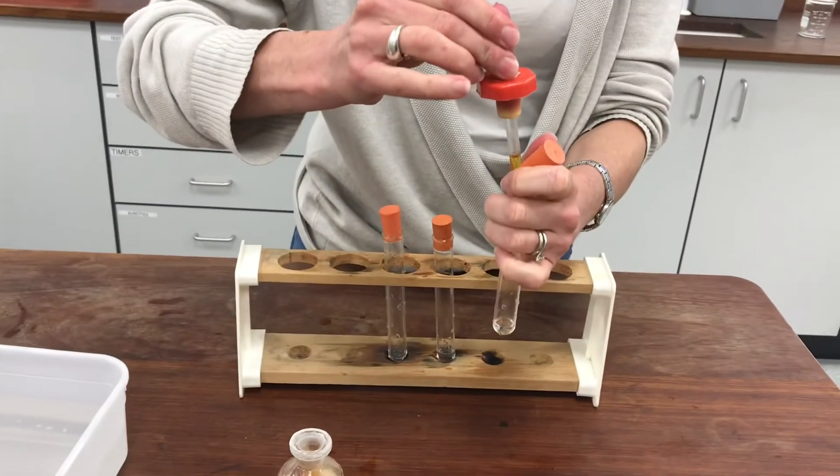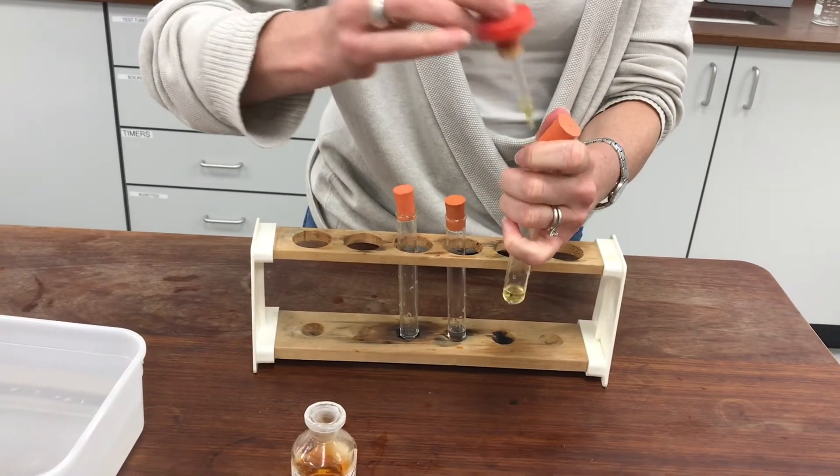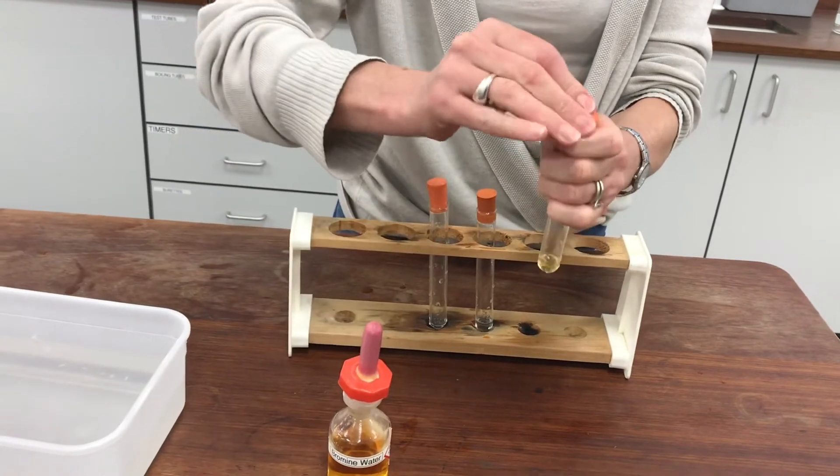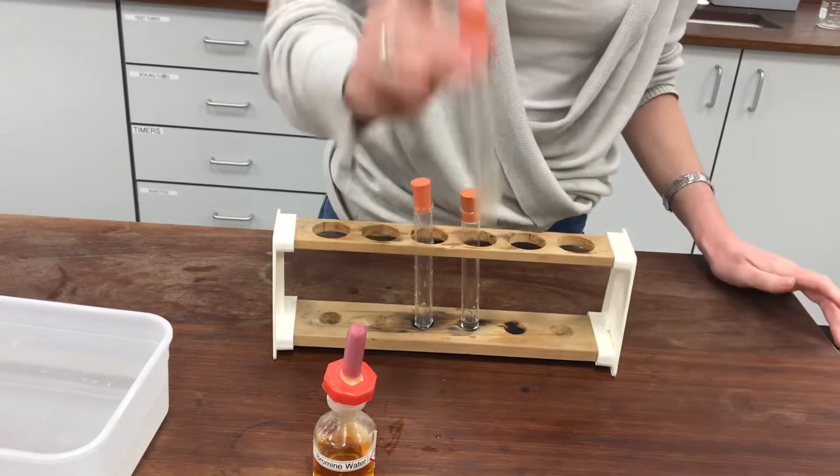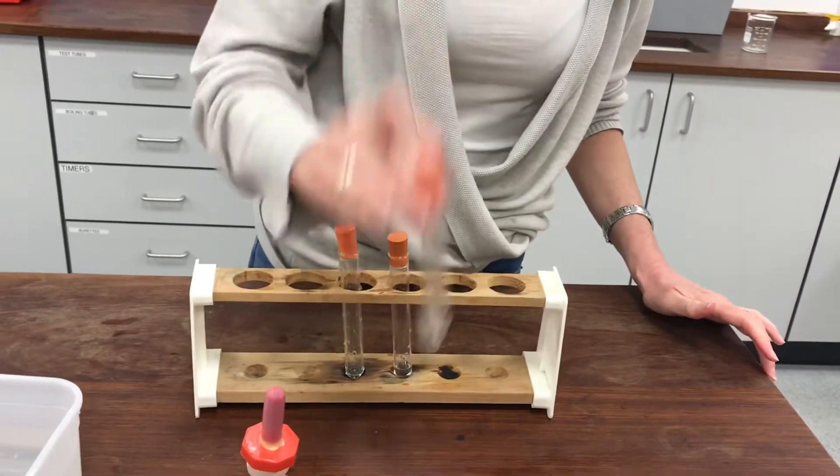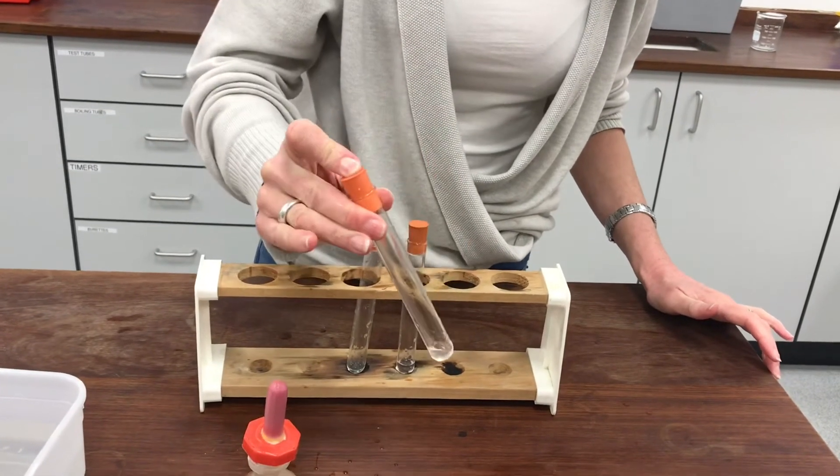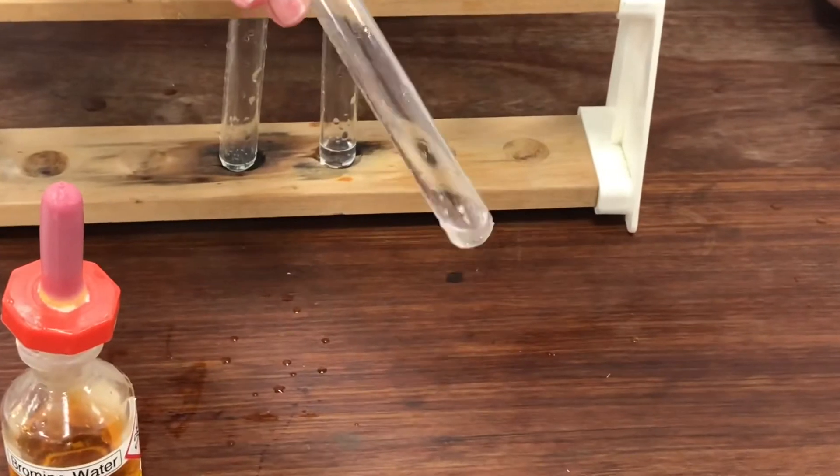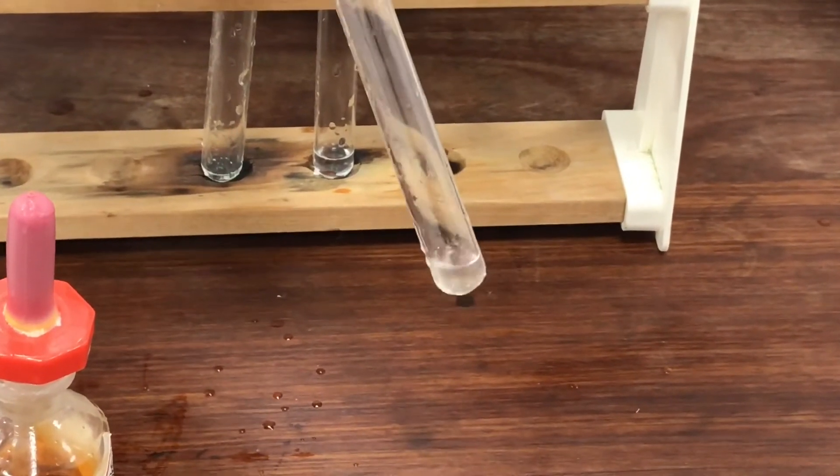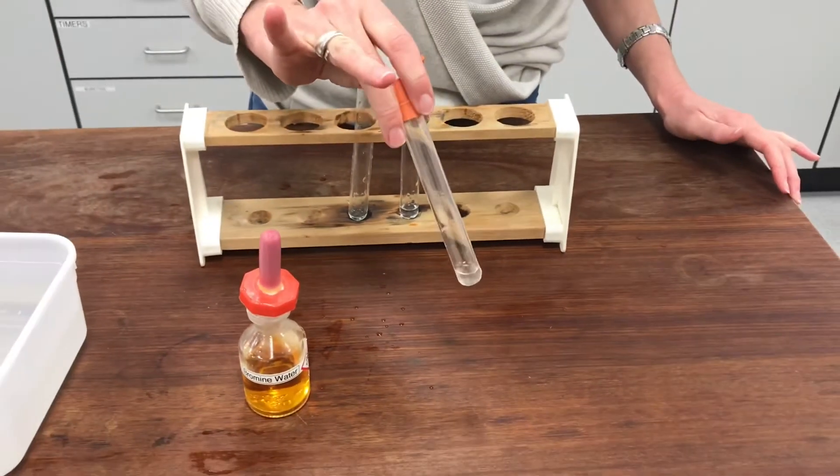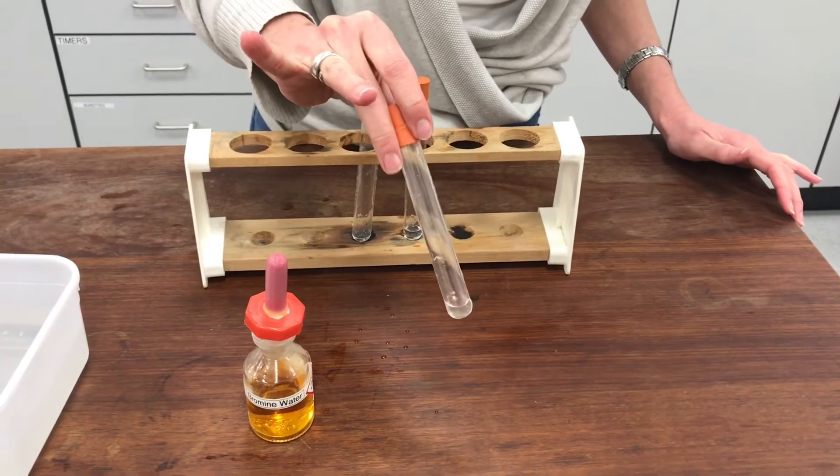A little bit of bromine water in there. And then I'll give it a good shake up so the gas gets a chance to react with the bromine. And I hope you can see that that orange colour of the bromine has completely gone. Which means it's not behaved as an alkane at all. It's something different in there.